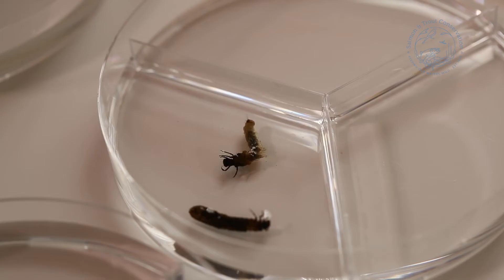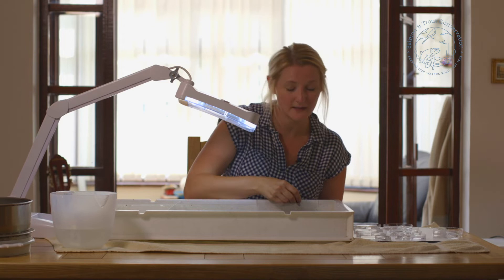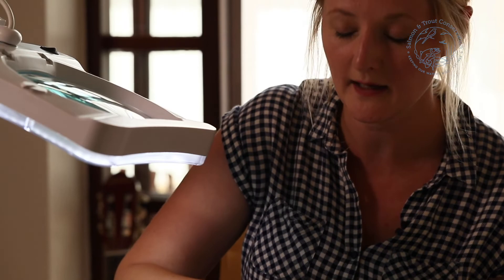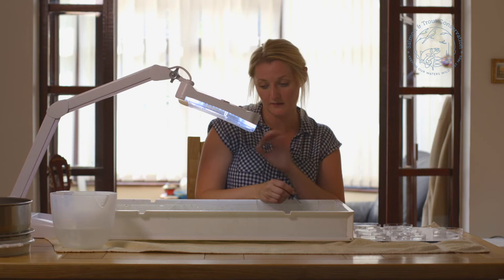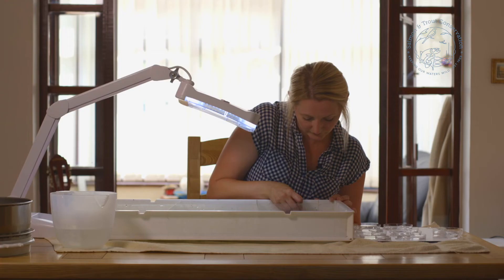We don't want to confuse anything with a piece of leaf matter or lose something because we think it's a pebble or a piece of grit. Now this is something I do day in day out so it does take me less time than it will take you initially. It can on an average sample take about half a day for me to sort through this. The important thing is that you've got all of the animals. You might also decide to split your sample — you might only clean half of it, so you can come back to the preserved parts at a later date.